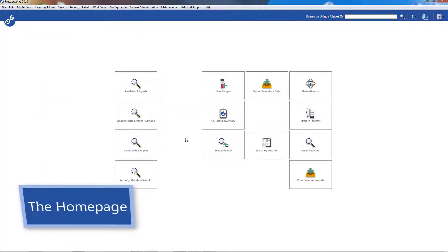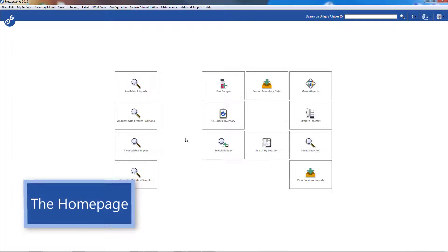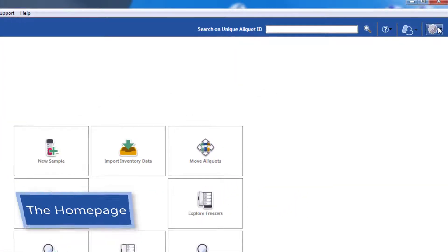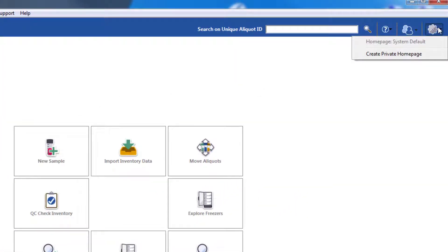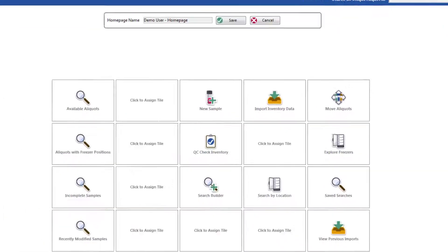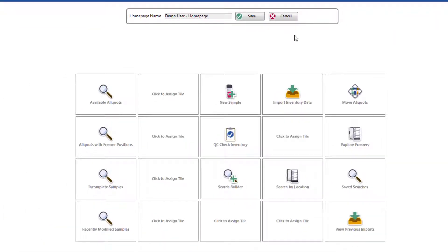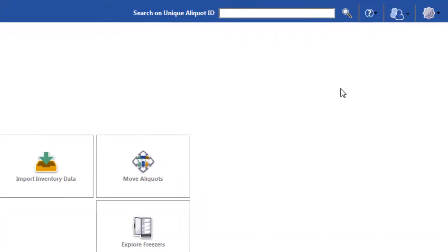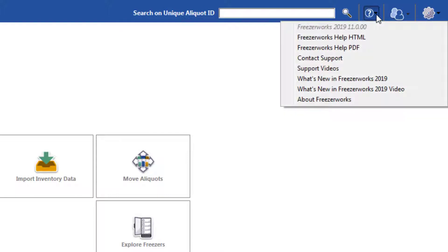The first thing you'll see is your homepage. Every user has one homepage that is either configured for them or that they made themselves. You can create your own homepage by clicking the gear in the upper right-hand corner and selecting Create Private Homepage. Another notable button here in the top right is the Help button, as it'll take you to our User's Guide, our Support page, and our Online Library of Training videos.